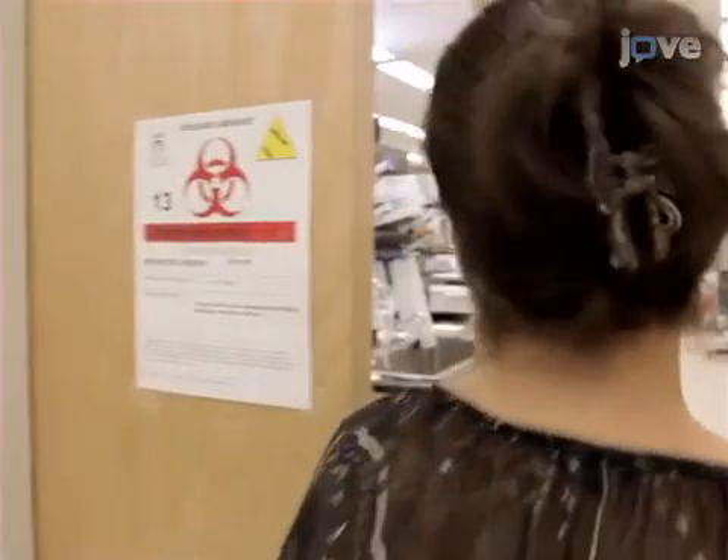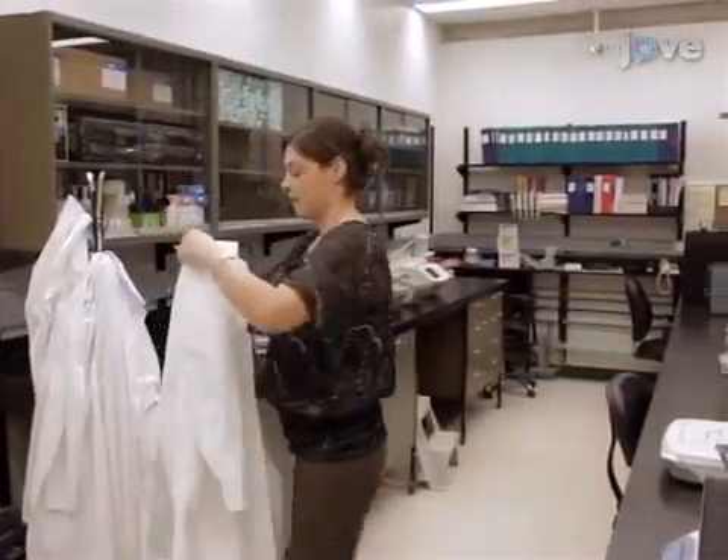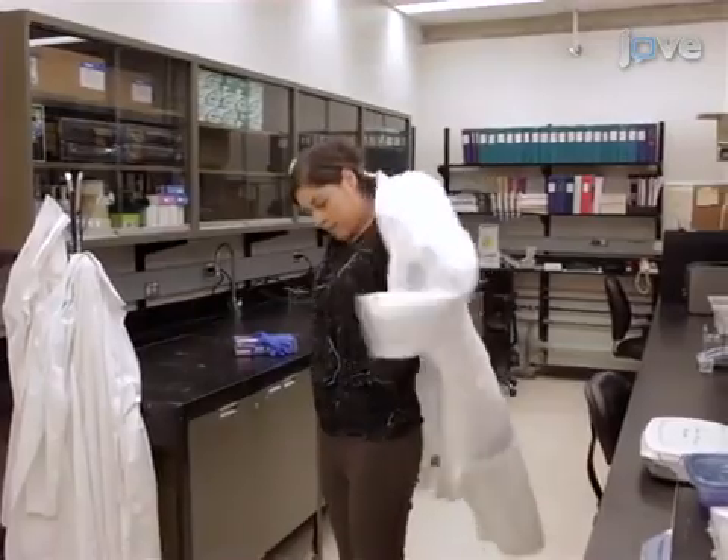These procedures should be conducted in a certified biosafety level 2 laboratory. Appropriate personal protective equipment should be used at all times.